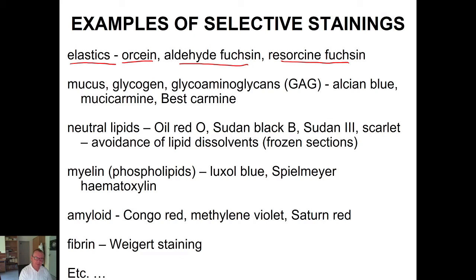And then we have got a slide where mucus is stained by mucicarmine, a special dye which is specific for mucus, and mucus is red in this situation. Maybe you remember that mucus was declared as almost colorless in synoptic staining. It doesn't stain well. The mucus granules are white or very light, but if we use mucicarmine, they are red, so you will see them very well in this one specimen.